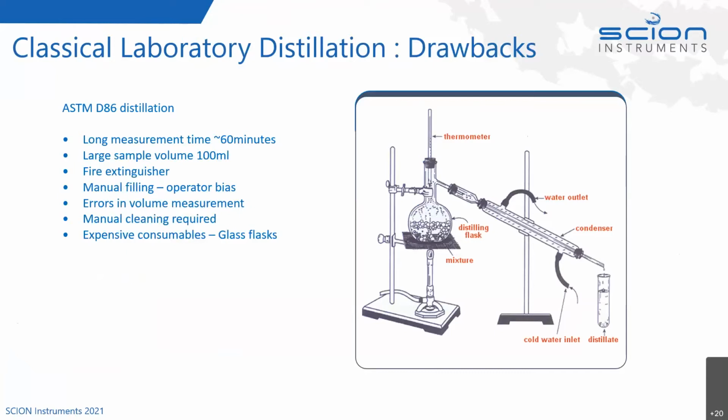With the safety, you'll find a fire extinguisher beside them, and it can be a manual filling process. There's an operator bias there, and there are also some errors in the volume measurement. Manual cleaning is required. The flasks themselves are quite an expensive consumable material.